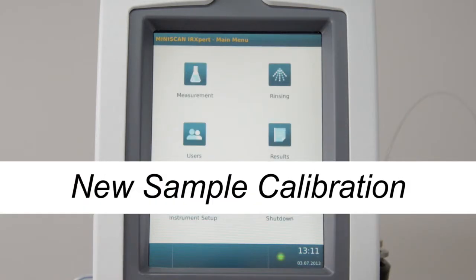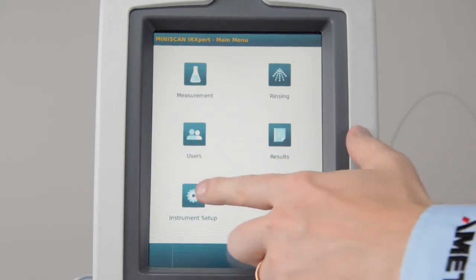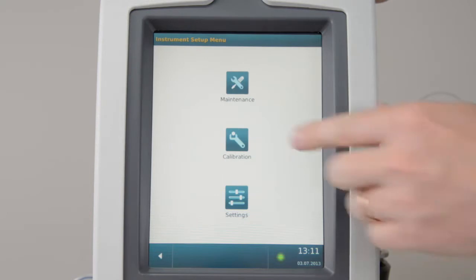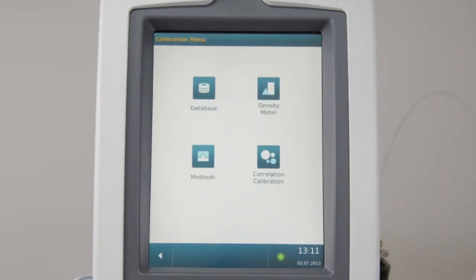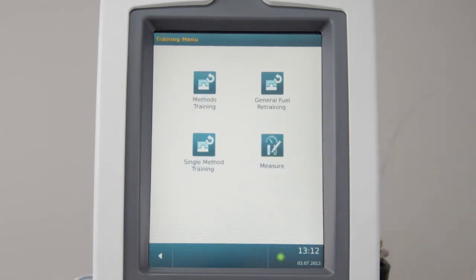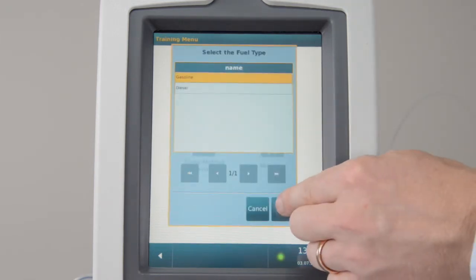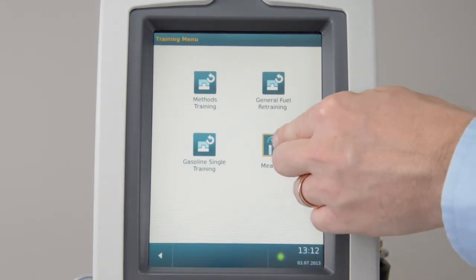New Sample Calibration. Calibration samples are required for the prediction of fuel parameters that cannot be measured directly. To add new calibration samples, go to Instrument Setup, Calibration, Correlation Calibration. Select the fuel type. Select Measure.